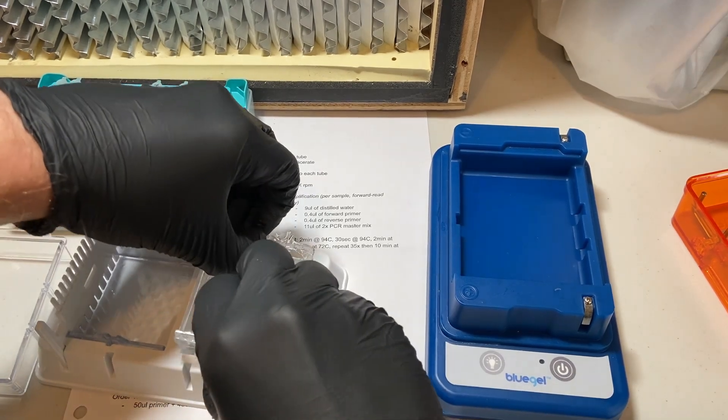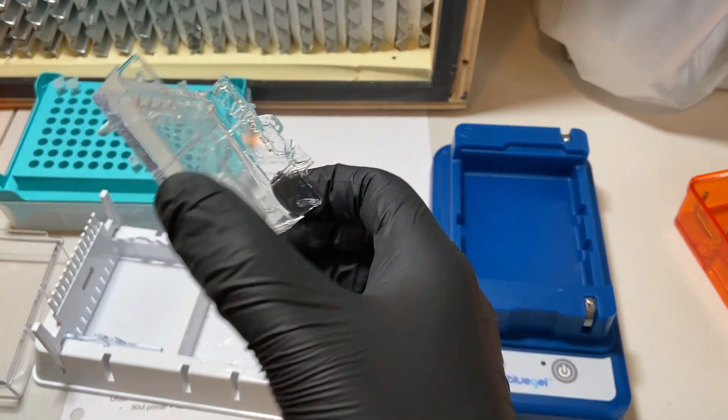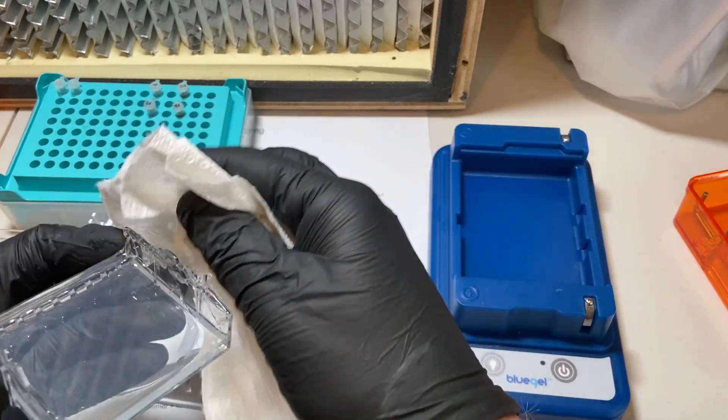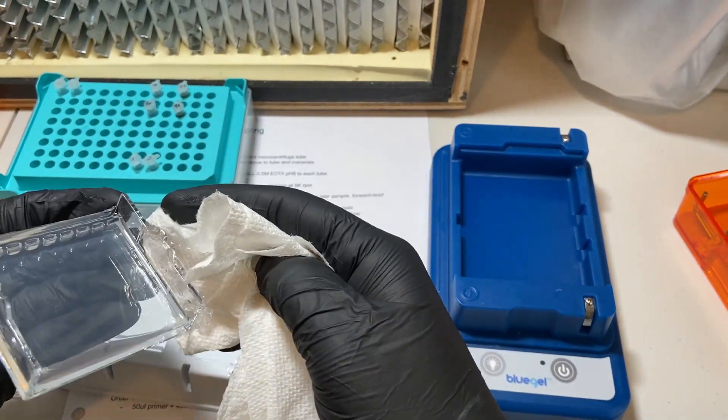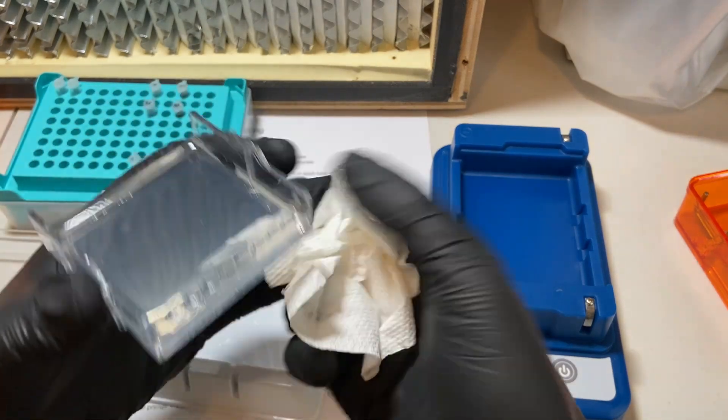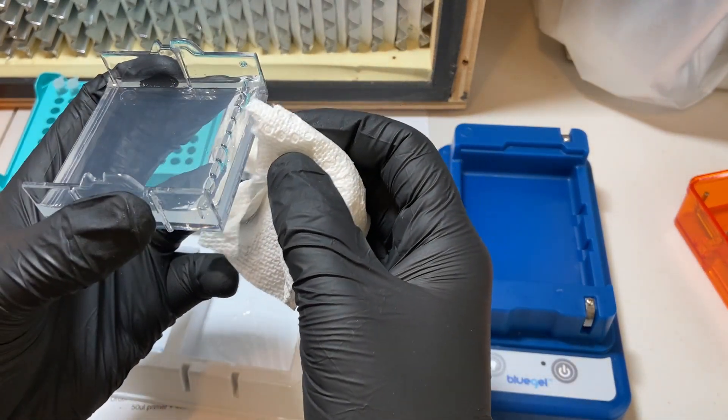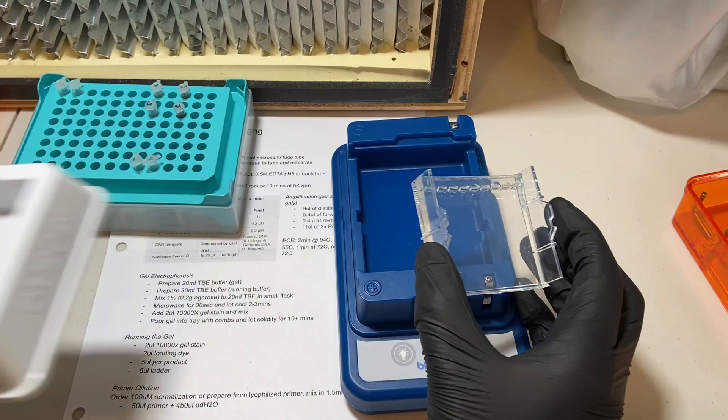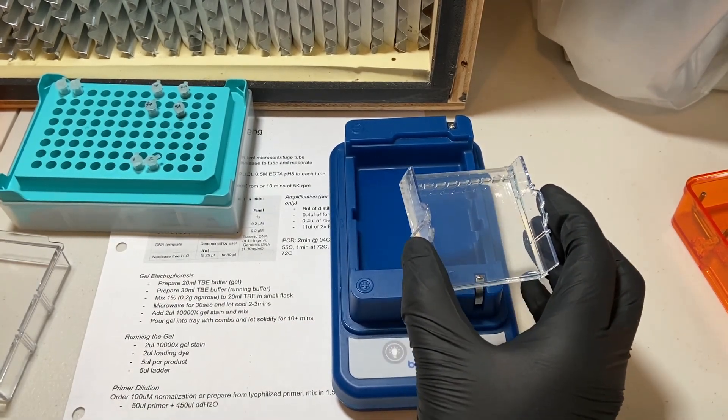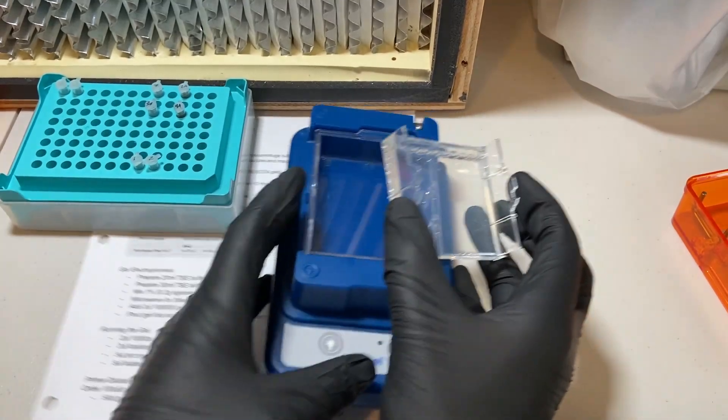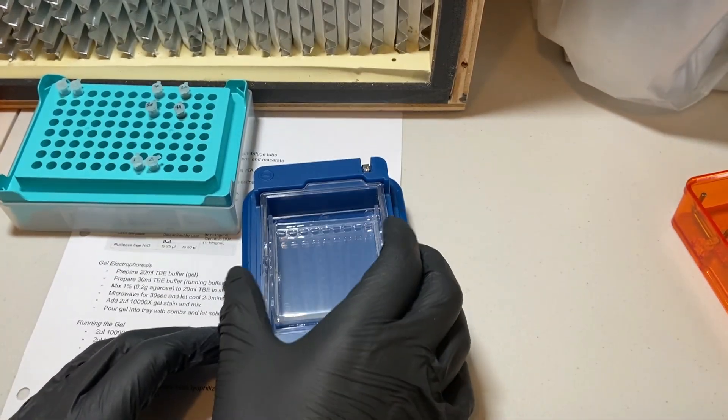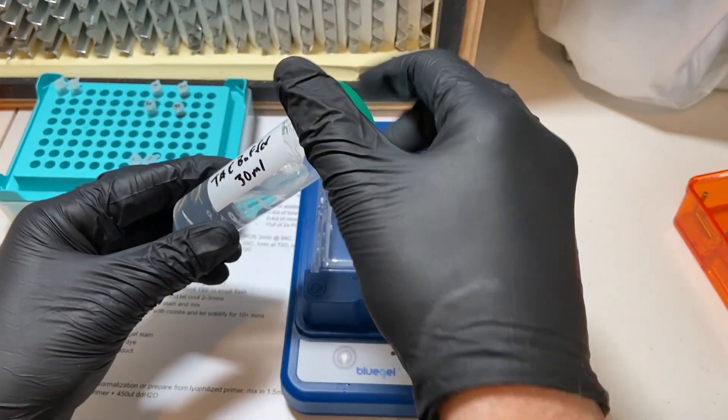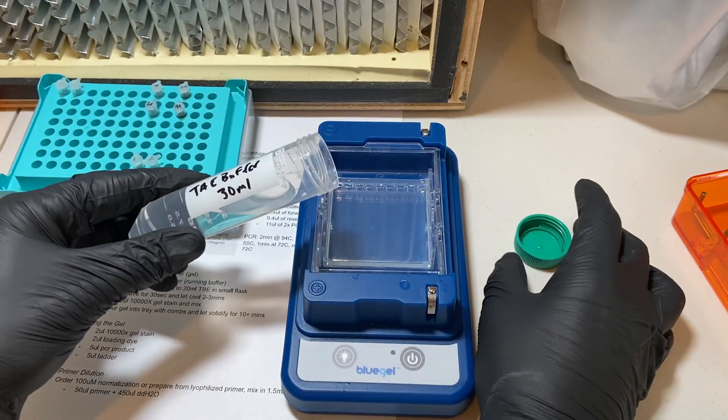Next, we're going to go ahead and remove the gel from the form. And you'll notice that in this case, there's quite a bit of excess around the gel itself. So just take a paper towel and wipe off all of the excess from around the edges. Be gentle with it so that you don't tear or break the gel in any way. I'm using a blue gel system here, but you could use really any electrophoresis system. This one's somewhat nice and affordable. It has some limitations like fixed voltage, but it works just fine for DNA barcoding.